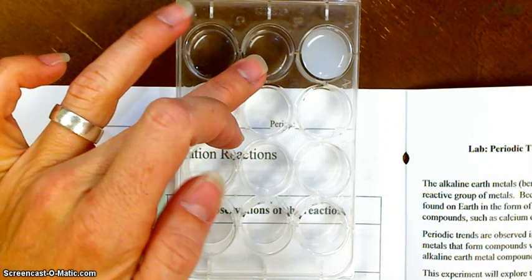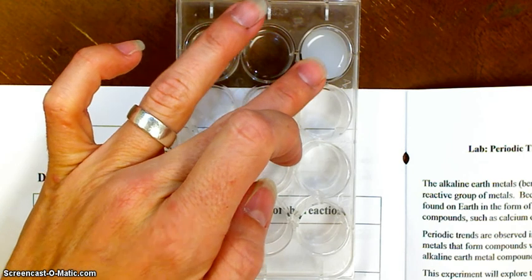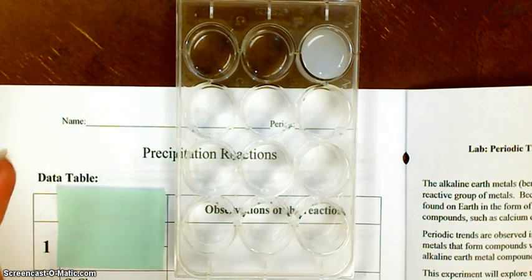It's this one, which is the NaHCO3. But when they got together, they formed a milky white precipitate. So in your observations section, you'll need to write down formation of a milky white precipitate. So obviously it goes from clear to a milky white, and the milky white is a precipitate.